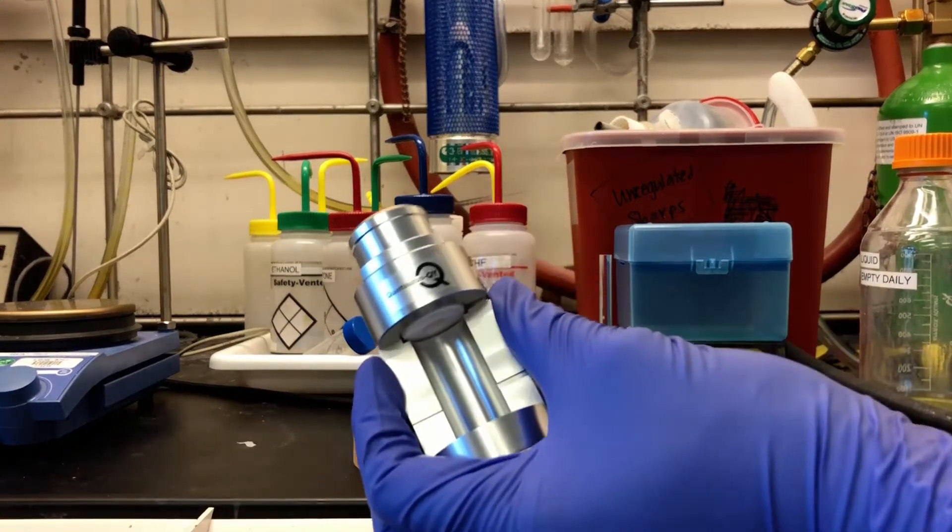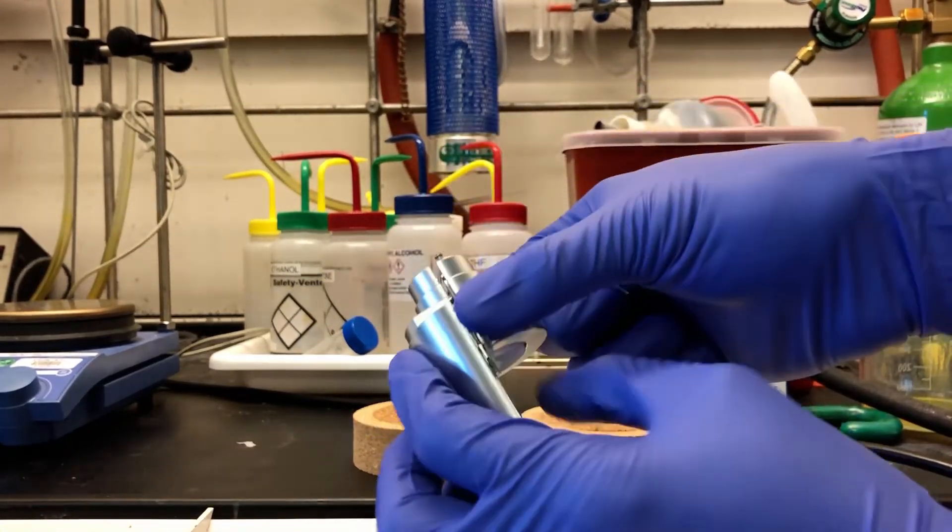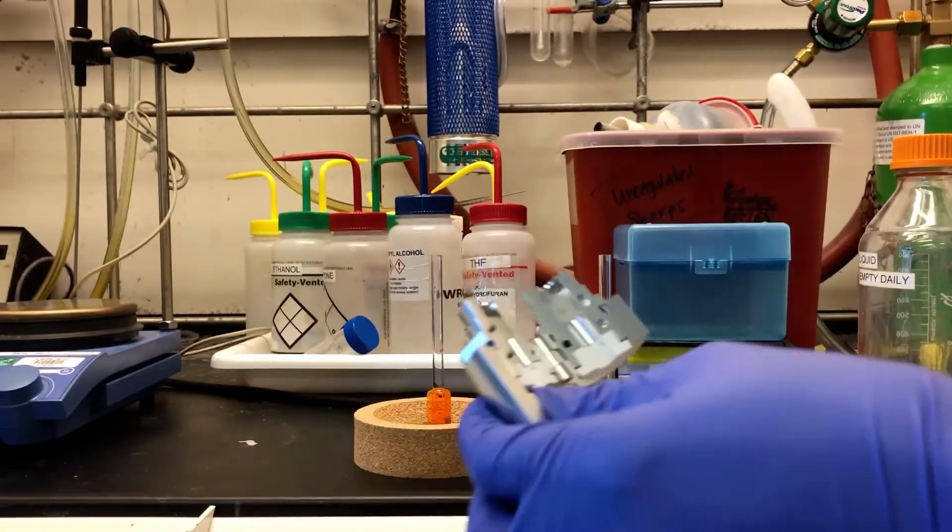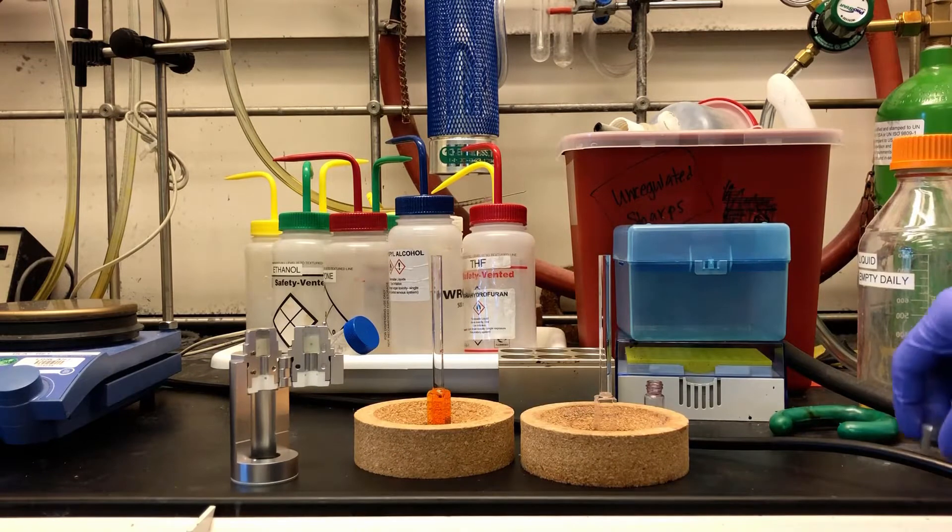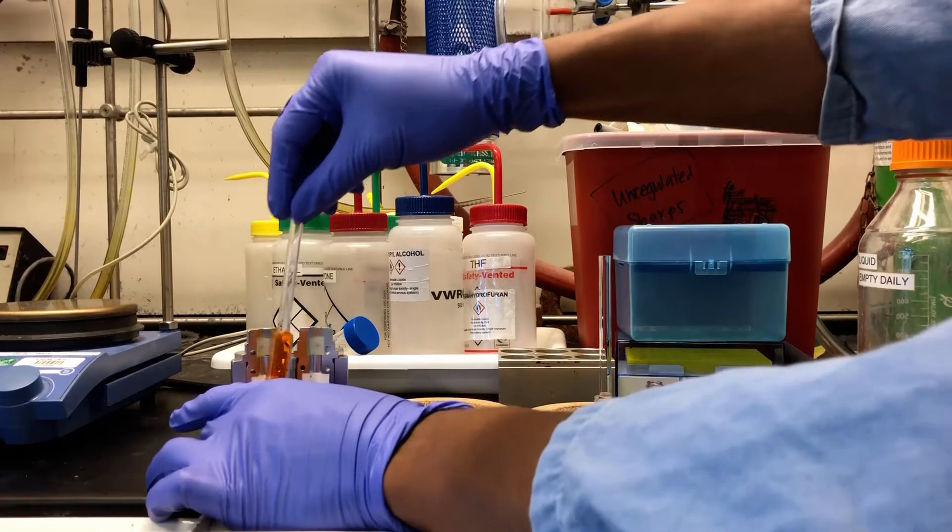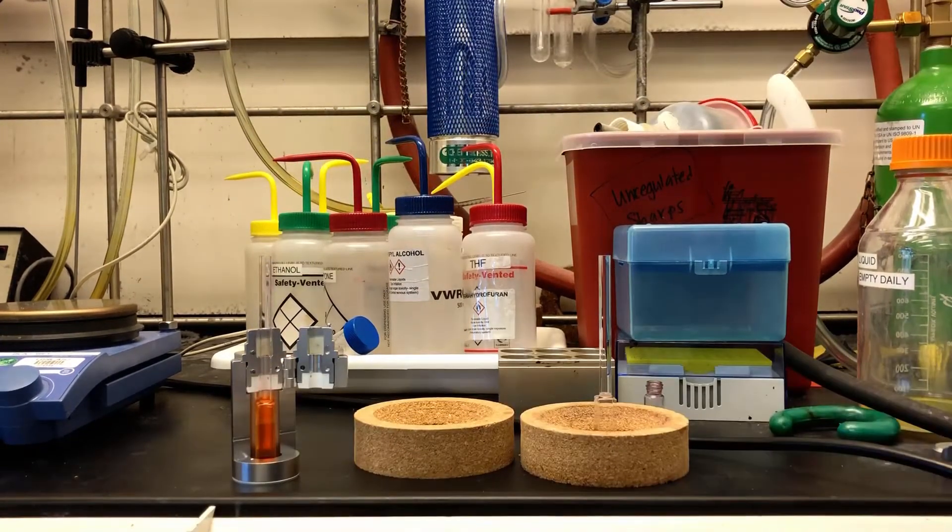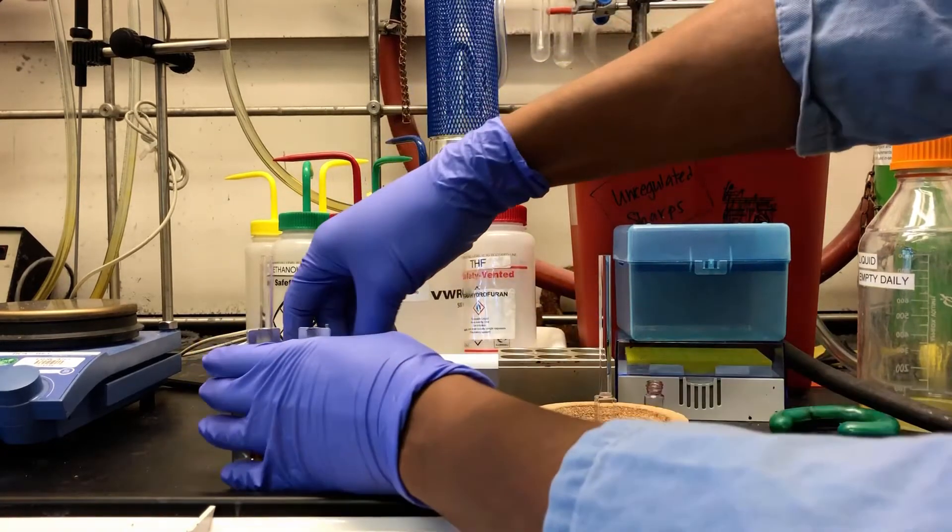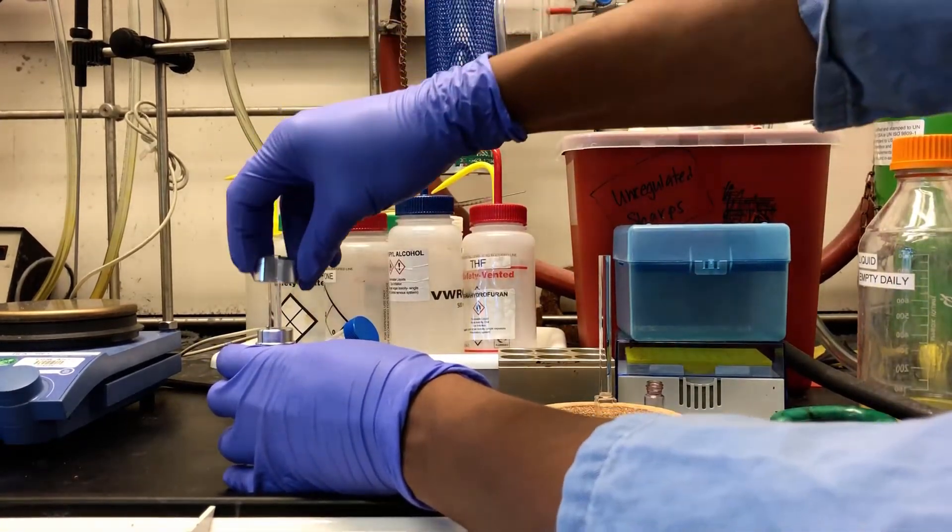There's a sample holder for quartz cuvettes that you can use while preparing your samples. Twist the ring on top to remove it. The two halves can be separated to install the cuvette. Once it's in place, cap the holder with the ring again to secure everything.